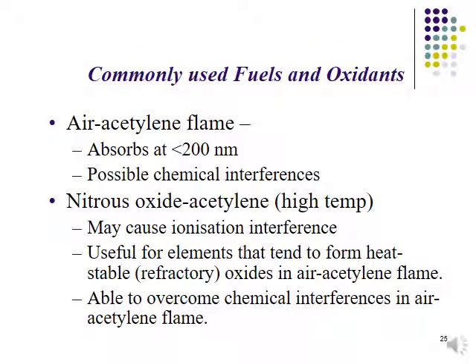So when we talk about the acetylene flame, we refer to the analytes that can absorb at less than 200 nanometer. In this mixture, there is possible chemical interference. There is always interference occurring, even in the instrument.